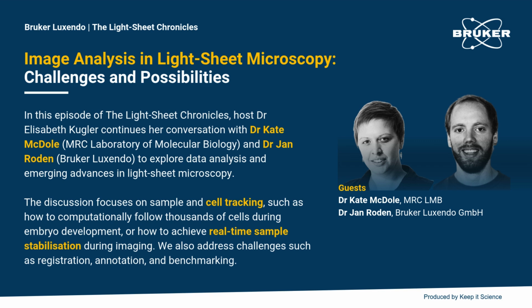Some of it is using post-processing methods that are, again, mostly machine learning based, to try and correct for some of the artifacts that come from the imaging. In regions where we just don't have good signal to noise yet, we're just not going to be able to track yet. But that's where things like mosaic reporters, where you have a single cell labeled in that region, may be able to get us more information than just tracking every single cell in the embryo.